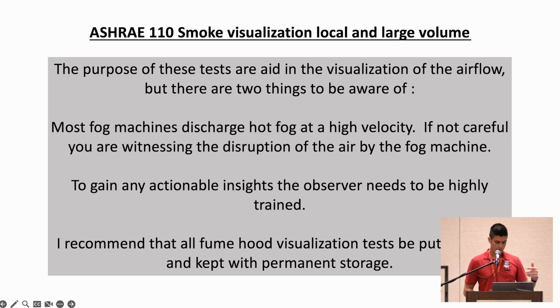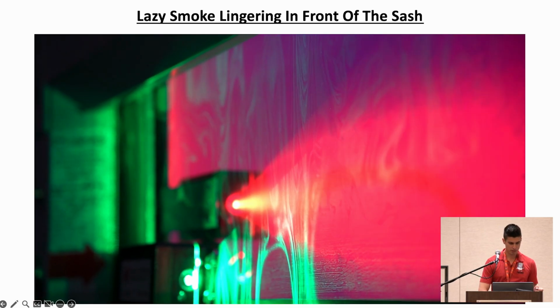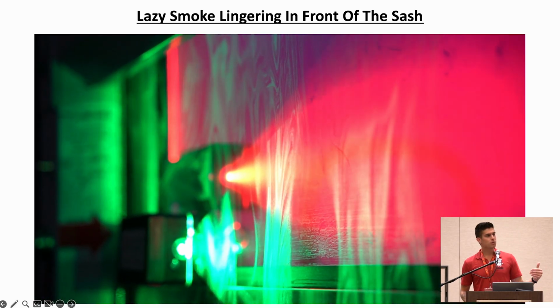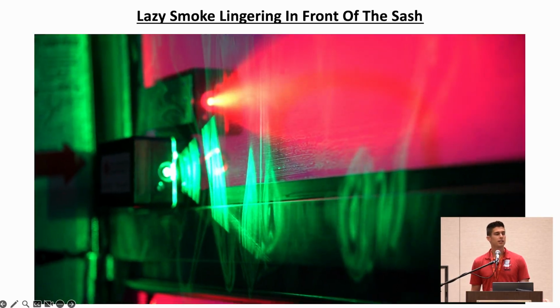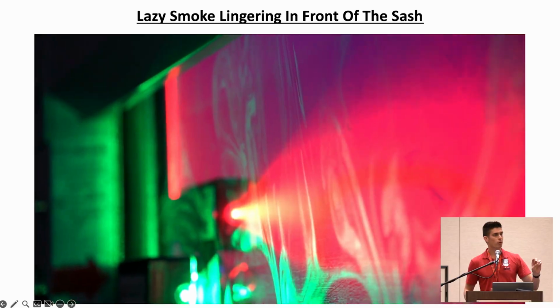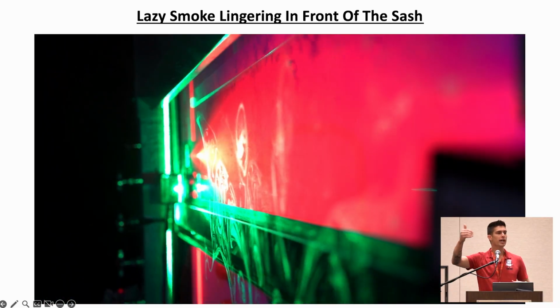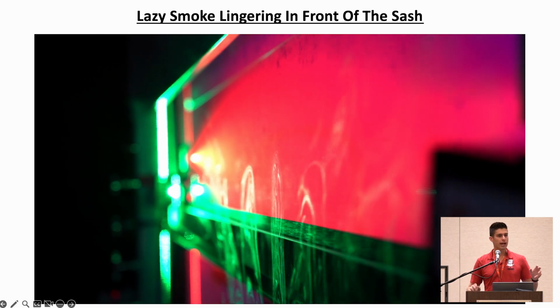See for yourself, right? Visual. Since 1991, that's also before I was born. So for a long time, people have actually been using lasers in their fume hood testing. And I'll just show you this little video right now. They've been using lasers in their testing, along with the smoke that we've always been using. But the lasers give you an ability to see more of the direction of where it is actually going.